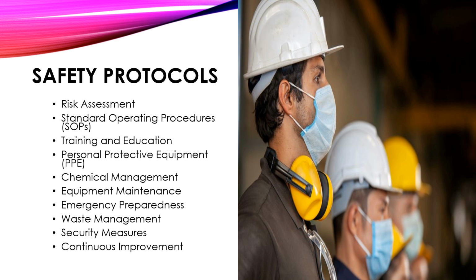Continuous improvement. Regularly reviewing and updating safety protocols, procedures, and training programs based on feedback, incident reports, regulatory changes, and advancements in best practices to enhance overall safety culture and minimize risks. Now, by adhering to these safety protocols within laboratory management systems, laboratories can create a safer working environment, mitigate potential hazards, and ensure compliance with regulatory standards, ultimately protecting the health and well-being of personnel and the surrounding community.